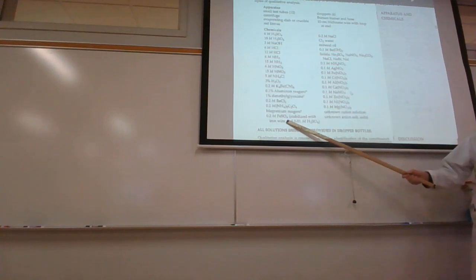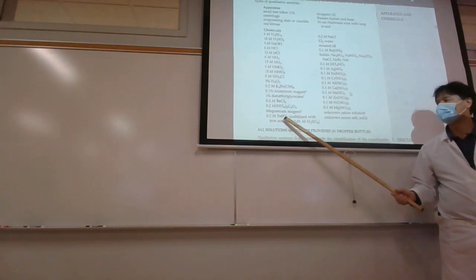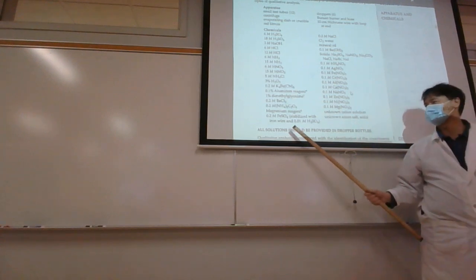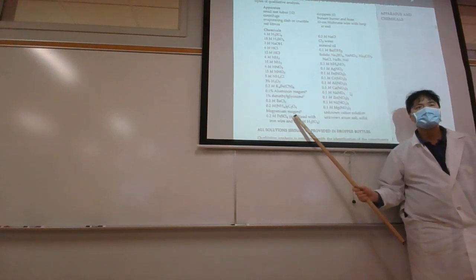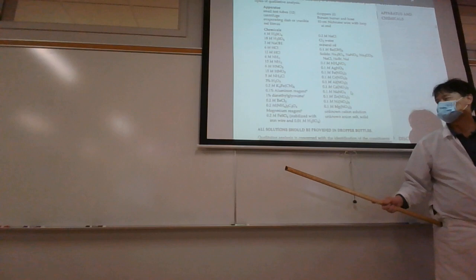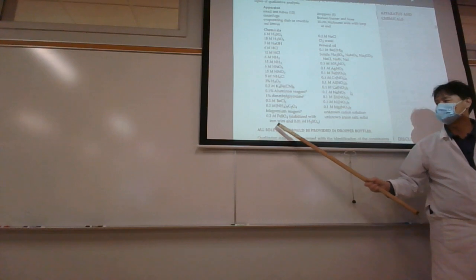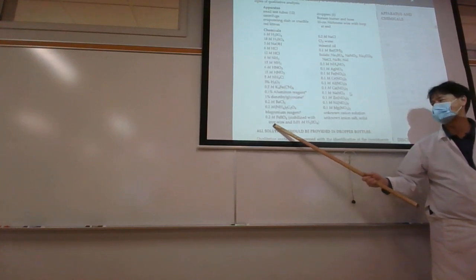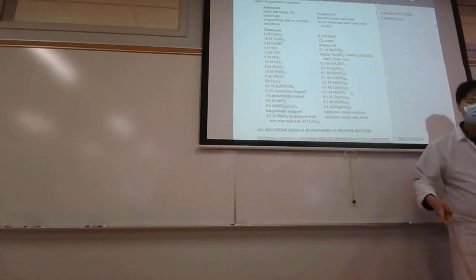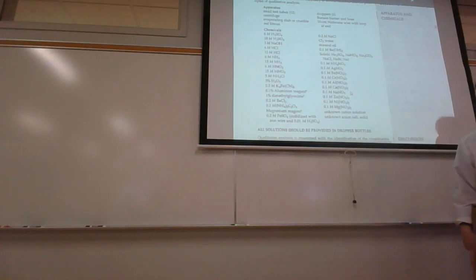This is stabilized with iron wire and 0.01 molar H2SO4. The iron wire, because iron(II) is a reducing agent and oxygen is an oxidizing agent. If we have a reducing agent that's even better than iron(II), that's what we call a sacrificial reducer. In the jargon of electrochemistry, we call it the sacrificial anode. The sacrificial anode, the reducer in this case, will be the iron wire and H+. So this will hopefully keep it stabilized longer, but ours is not. When you look in our green bottle, there's no iron wire or sulfuric acid present.